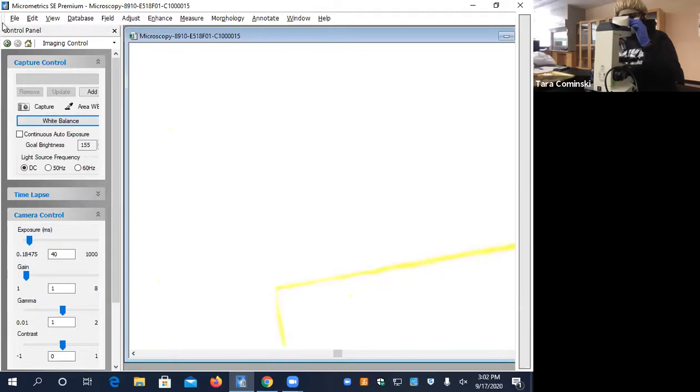Worked yesterday. Oh, maybe it's working. All right, so you guys see my screen. You can actually see what I have in my microscope. It's sort of uninteresting. Obviously, the letter E.